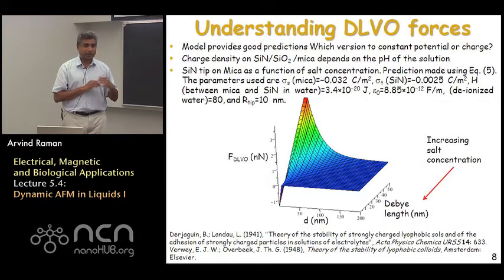On the other hand, as you start increasing the salt concentration, two things happen. The Debye length decreases, but also the intensity of the electrostatic forces starts to change, so much so that the van der Waals forces start getting screened very strongly. So that when you deal with very large concentrations, you're dealing with effectively no interactions until you come very close to the surface, and then suddenly you get this exponential growth due to the electrostatic forces, and the van der Waals forces are not very visible.